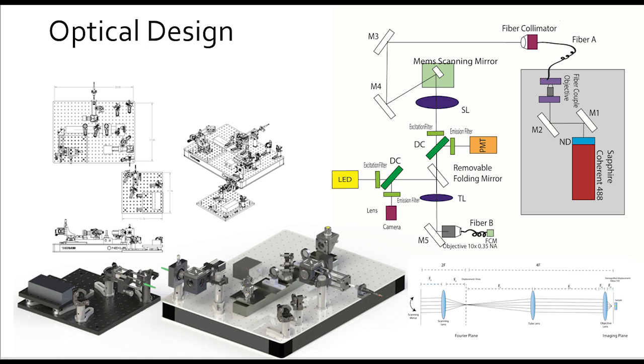So we need this light to be collimated into our system. We would like to fiber couple it. That means we're running this through a fiber. And to do this, we use the tilt and turn knob on two mirrors to get this light to perfectly direct into the objective, which can be translated through a fiber. And this light can move all the way through the fiber and out into the fiber collimator. So now this light is collimated. This is moving straight. It's not focusing.